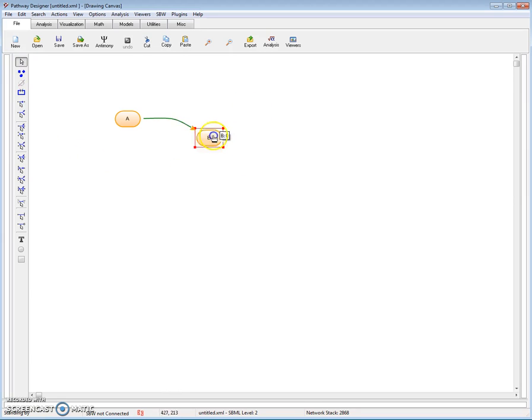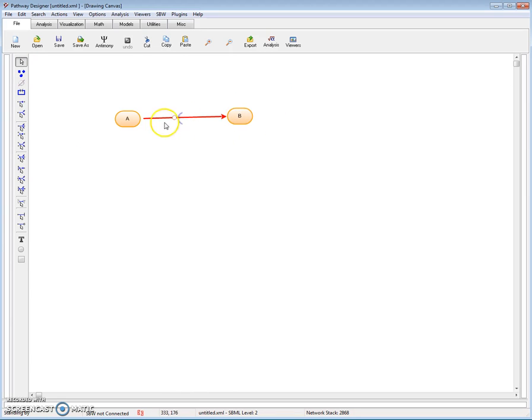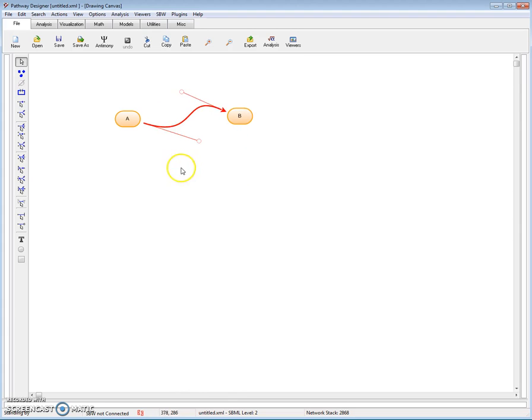And likewise, when I move the node around, the reaction follows. If I select the reaction, I get these control points so I can reshape the reaction if I want.